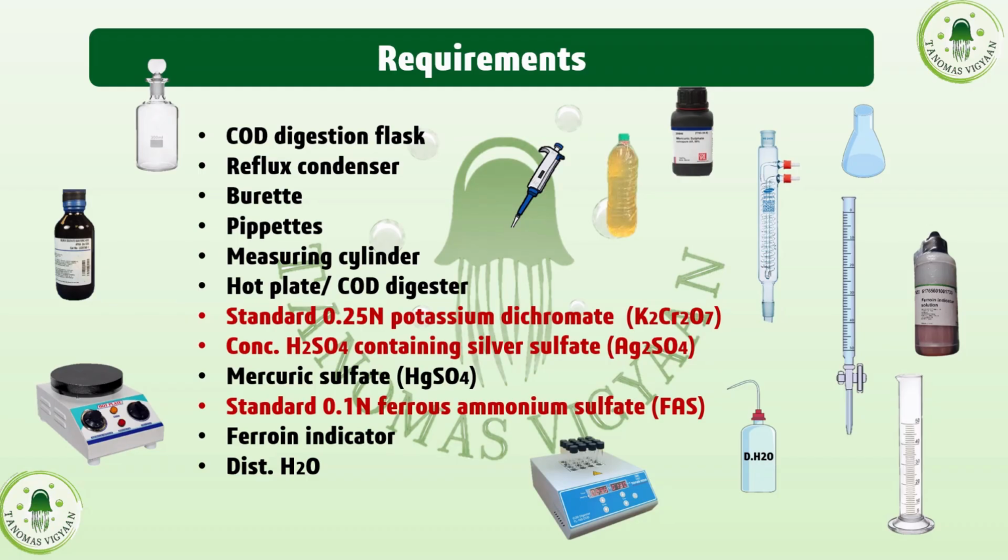These standard solutions are not covered in this tutorial. Here we will only talk about the procedure and how to calculate the COD. Preparation of these reagents is done beforehand, before you do the COD experiment.